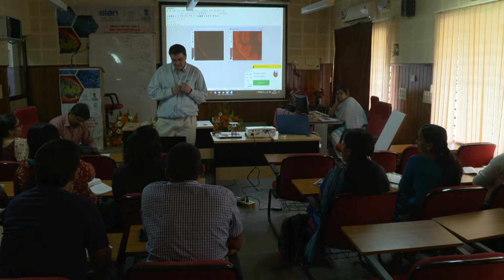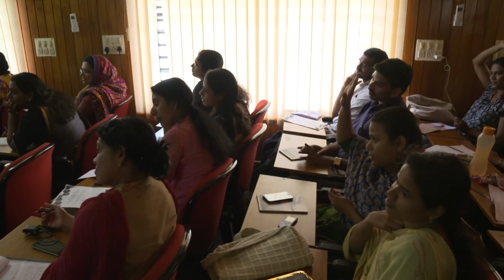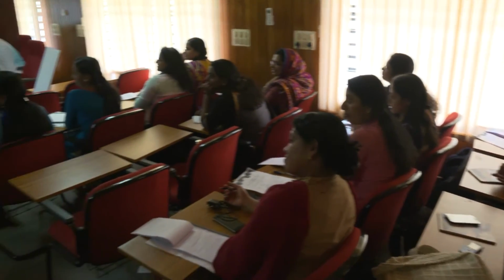Propidium iodide is a good dye that tells you what about a cell? That's dead. Exactly. Okay.